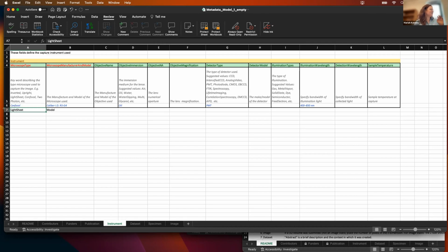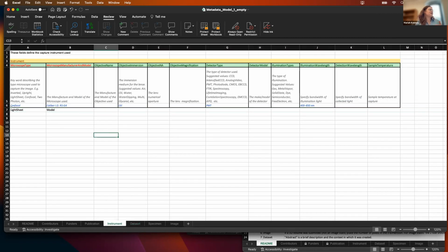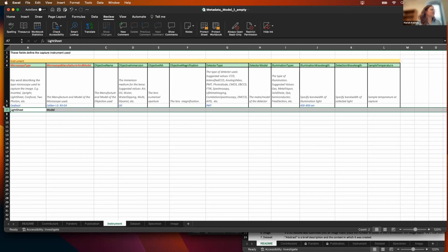Because everything is listed in a way that it would be one row, we'd have to really look at that and see how to interpret that for your specific data set, and see, does that need to be broken up into multiple submissions, or is there a way that we can represent that in these fields in a way that doesn't break any of the models that we currently have, or maybe we need to kind of.